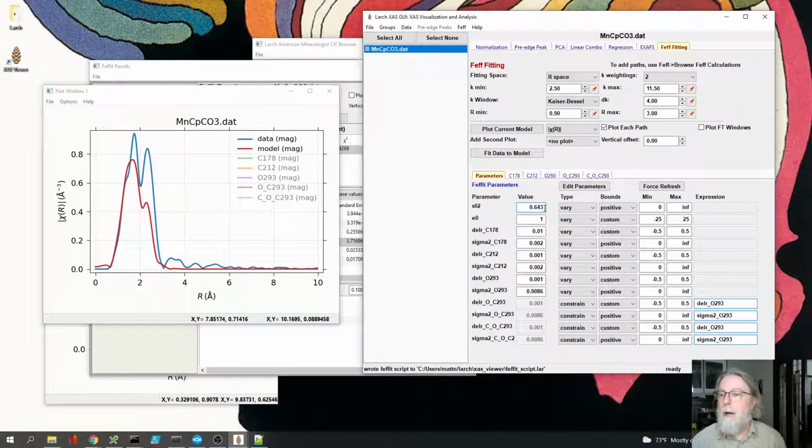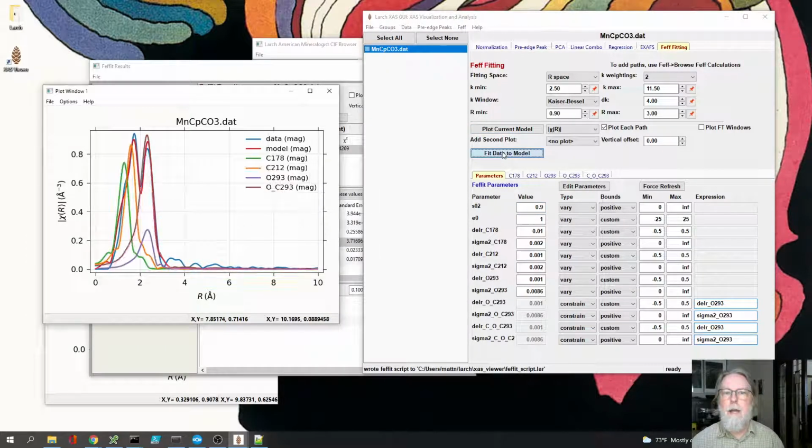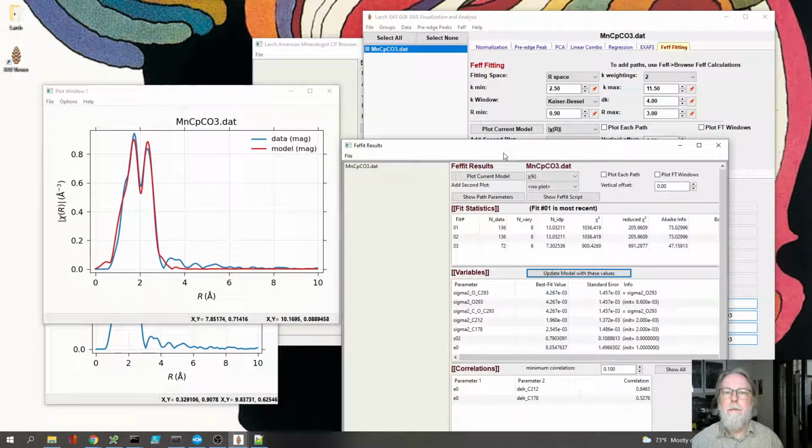And I'm asserting that our structure, that this is the right structure, that it's 5 in the ring and 3 for the carbonyls. We can test that next, but let's just try that. If I plot that current model, it's still not great, but let's do a fit to that, and we get a much better result. Now that's the fit, and I'm calling that not too bad.